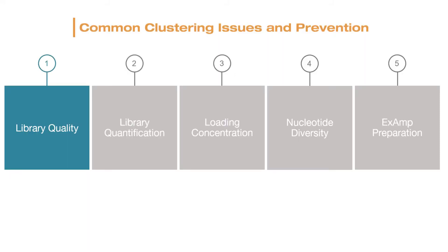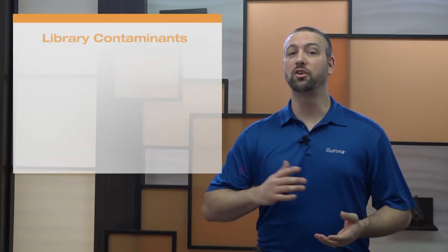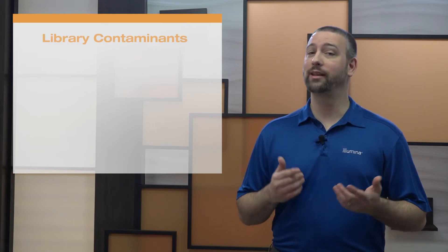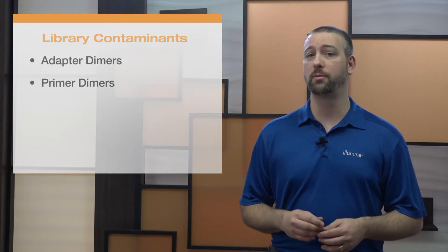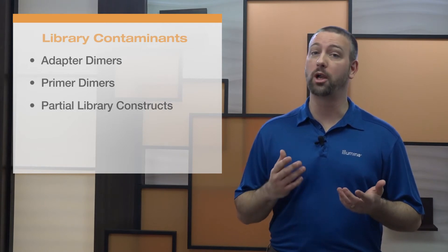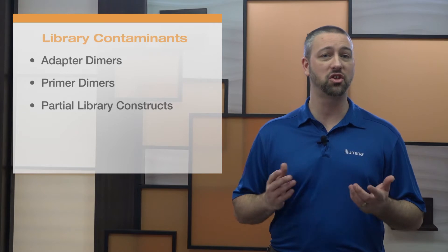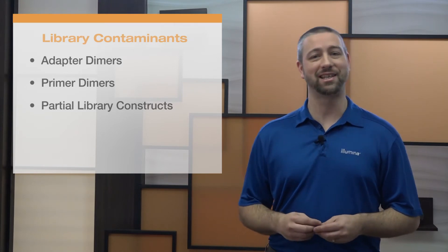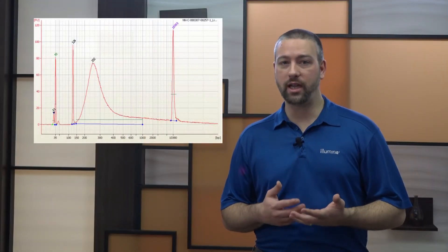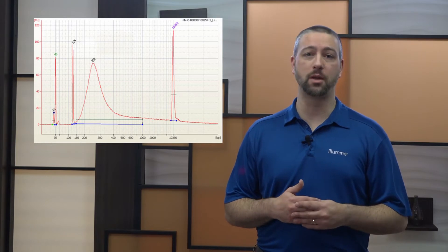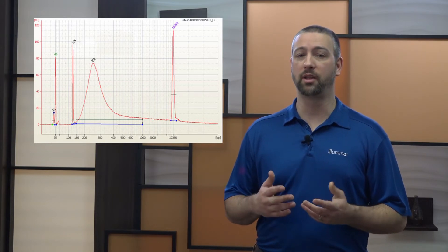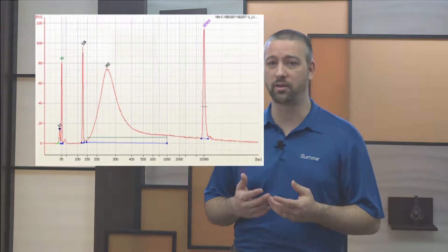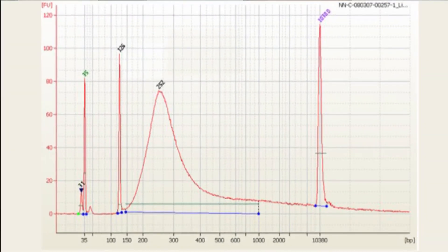Let's first talk about library quality. Library preparations that undergo insufficient library cleanup leave contaminants such as adapter dimers, primer dimers, or partial library constructs in the final library pool. In this case, quantification of cluster-generating fragments can be inaccurate due to these contaminants, which can lead to inconsistent cluster densities. Be sure to verify the quality and purity of all libraries using the method described in the appropriate library prep documentation. Commonly, Bioanalyzer, TapeStation, or Fragment Analyzer can be used to check library integrity, average insert size, and unexpected contaminant peaks, as seen at the 120 base pair peak in this example.